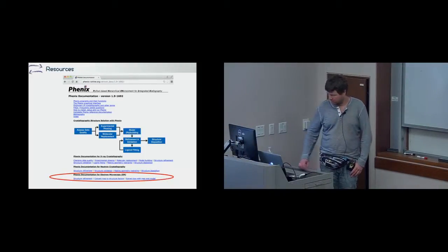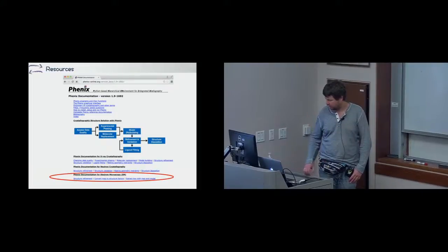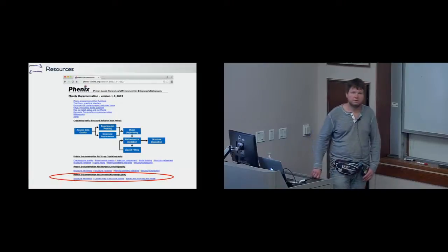And so yeah, I think I'm done with this part. Just to mention, we're thinking of doing next steps. We're thinking of working with Sasha or Junsif on defining a standard way of CryoEM map resolutions. So how you calculate resolution of a CryoEM map. We have some ideas. I will voice them once we are ready to show something. So this is something we are working on very actively. Hopefully soon we'll have something interesting to show.